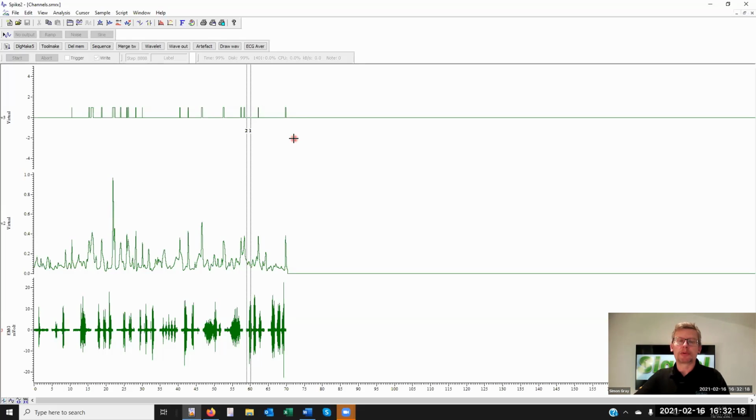Okay, so we do have people talking about looking at frequency content of an incoming signal and reacting to that. We're just looking at the data that's arriving at the 1401. Okay, so generally unprocessed. Right.